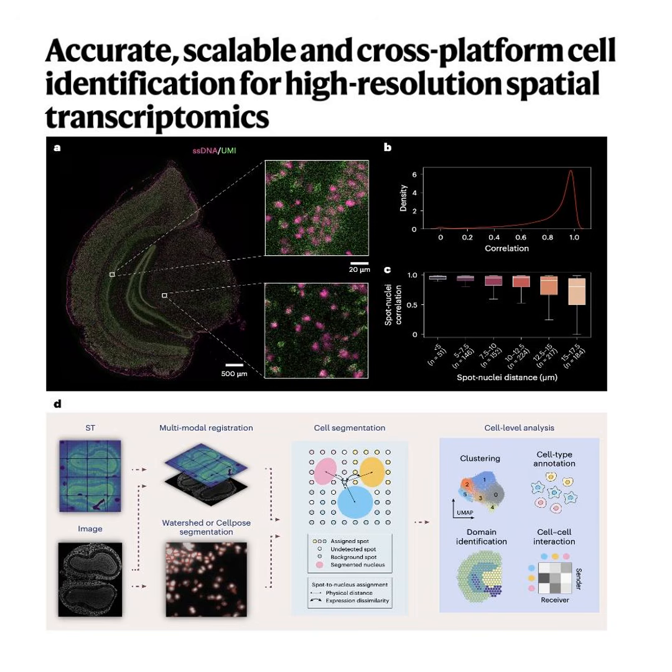So then researchers tried the other extreme, unified deep learning methods. Things like SCS and UCS. Right. These neural networks are trained to draw strict morphological boundaries based on intense feature extraction. But because they are so aggressively hunting for a physical boundary, they end up scooping up extracellular noise.